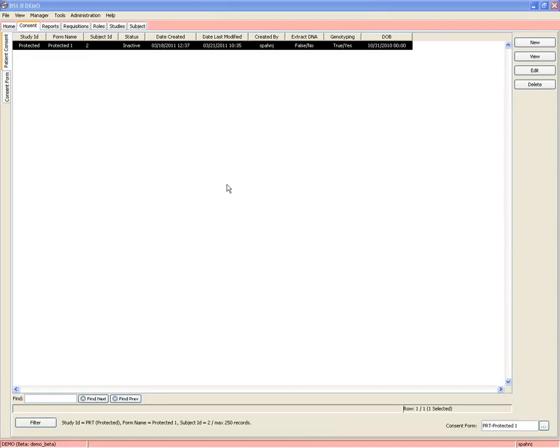Can the error messages be sent to other users other than at the time of including the specimen? Sure, we can send notifications out. We can customize notifications. We would just need some more details about what notifications you want sent out. I will tell you that there is an RFE for consent to add any warnings that were found during requesting to the PI email, the email that goes to the PI when specimens are requested.